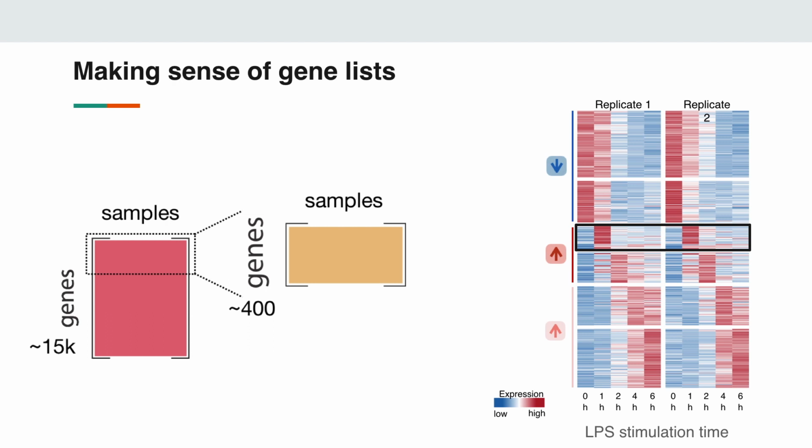And now you still have quite a large list of 400 genes to try to understand what's going on in your samples. And you can do an old school sort of analysis where you go through each of these genes and you try to make sense of them together and figure out what is a possible mechanism acting in your experimental condition or any other shared feature of these 400 upregulated genes. But a pathway analysis might lead you to that information in a much less labor-intensive way.